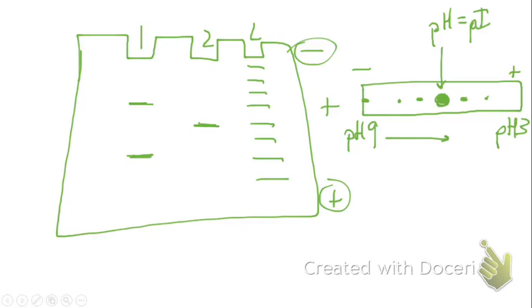And so it's a very powerful tool, especially in things like cancer, and when people study cancer cells and a variety of different tissues, they use a lot of two-dimensional gel electrophoresis. So we're going to end this here. I'm not going to worry about talking about how proteins are sequenced. Edman degradation, Sanger sequencing of proteins, you can look them up on the internet. The most common way we now sequence proteins is through mass spec. And if you find that interesting, I would recommend looking at those and just learning more.